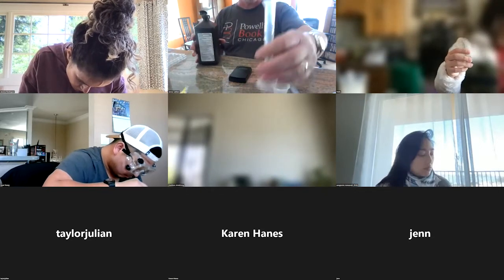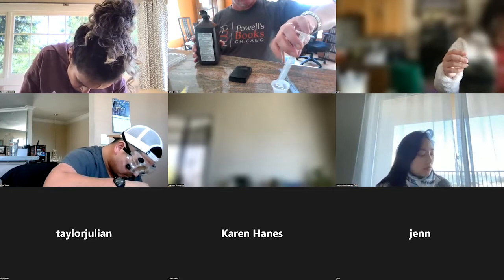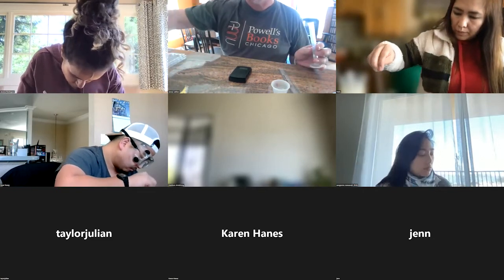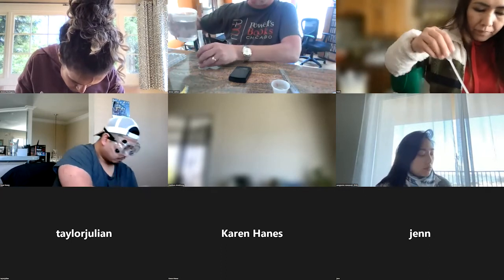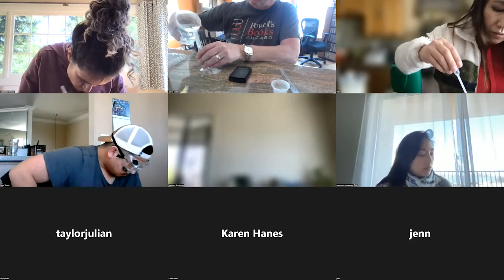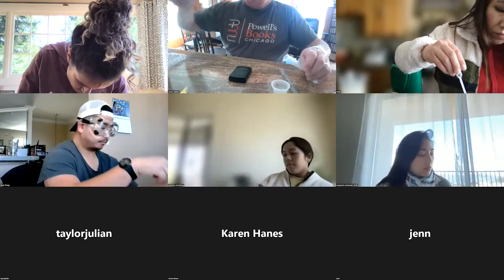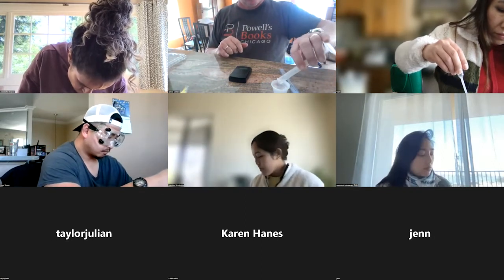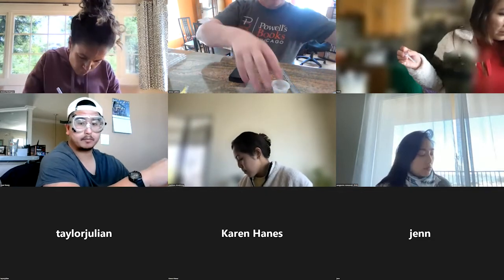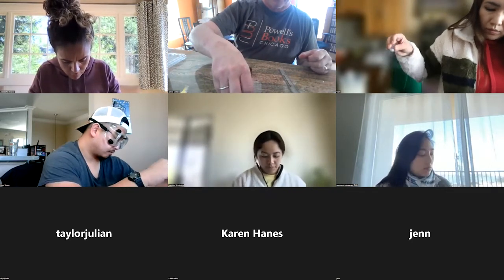So 10 mils, and 10 mils of water. There's our 10 mils of water. Just give that a little shake to get that stirred up.